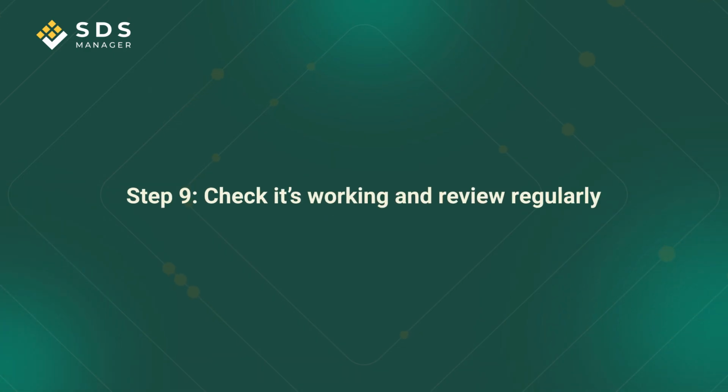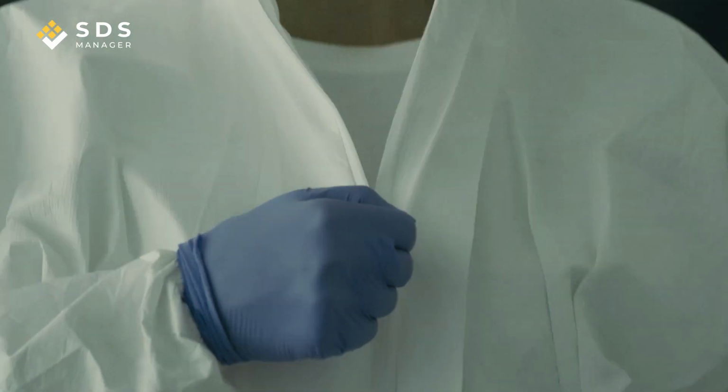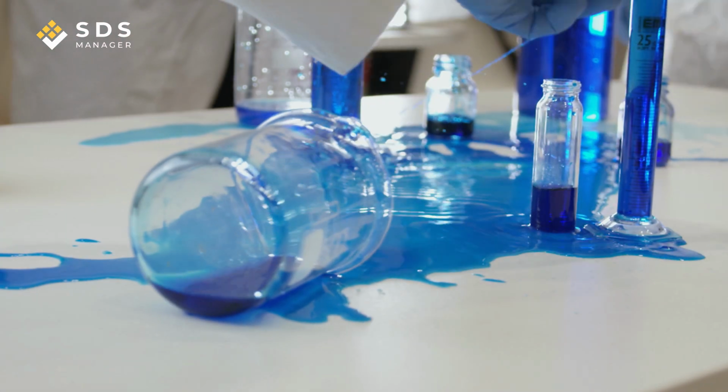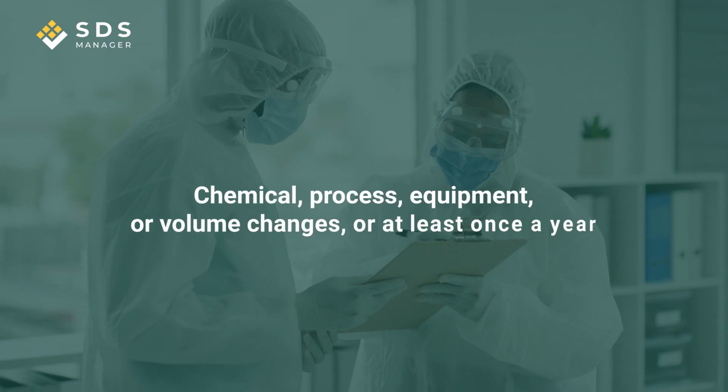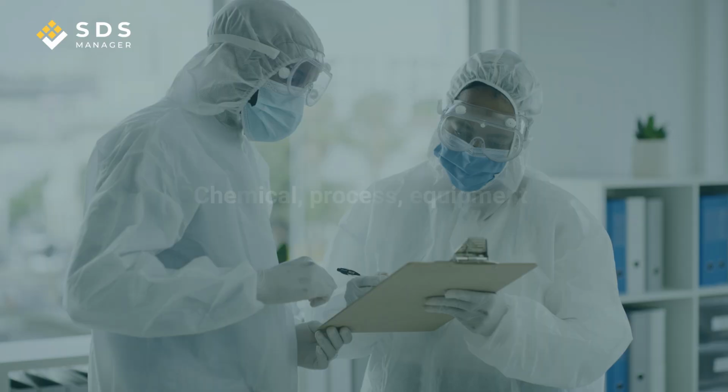Step 9. Check it's working and review regularly. Make sure ventilation actually pulls air. Check PPE is the right type and fits. Record and review incidents or near misses. They are lessons. Review the assessment when the chemical, process, equipment, or volume changes, or at least once a year.